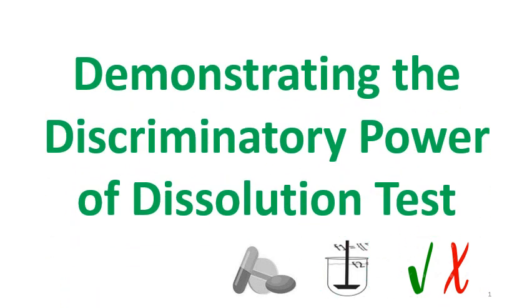Welcome dear viewers to another informative video on demonstrating the discriminatory power of dissolution test. Nowadays all the regulators are asking to develop a product specific dissolution test, then the clinically relevant specifications, and that's why the dissolution test becomes very critical.